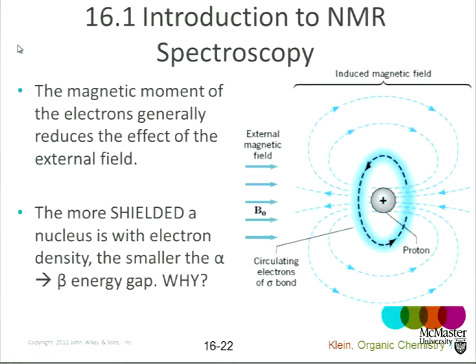All right, so why do all carbon nuclei not resonate at the same frequency? Why do we see ranges of chemical shifts? That comes about because an actual nucleus in a real molecule is surrounded by circulating electrons. Electrons are negatively charged. They interfere with the magnetic field getting to the nucleus. So it turns out that the chemical shift in carbon and in proton NMR, the position along the x-axis in an NMR spectrum, is the result of the electron density around the nucleus. Lots of electrons, the nucleus is shielded in part from the applied magnetic field and resonates at one frequency.